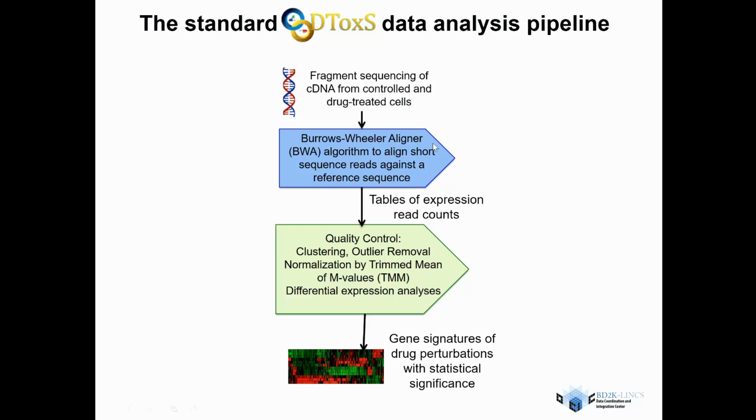And then a second Python script takes those SAM files, which have the alignments, and applies the UMI filtering and gives us, at the end of the day, a list of counts. How many normalized counts are in each gene that come from the original experiment. And then this is fed through to a Bioconductor package, which actually determines which genes are differentially expressed.